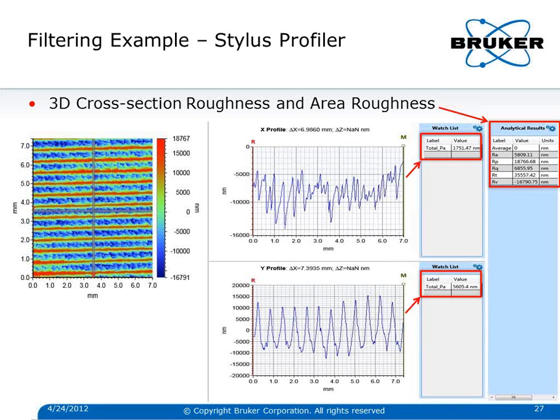So there's a lot of value to doing 3D analysis with a stylus profiler, in addition to doing the 2D profile. So you can either do single profiles of multiple locations or multiple parts and compare them, or you can do 3D analysis by doing multiple scans. Now, the way that a stylus profiler does 3D analysis is by rastering multiple scans across the surface.